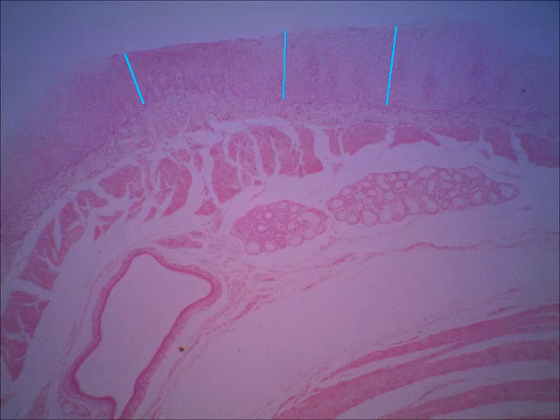And now we'll look into the submucosa, and if you look at this area right through there and right through here, those are some mucus glands that are down in the submucosa. And over here, that's probably a large duct that those mucus glands are emptying into.